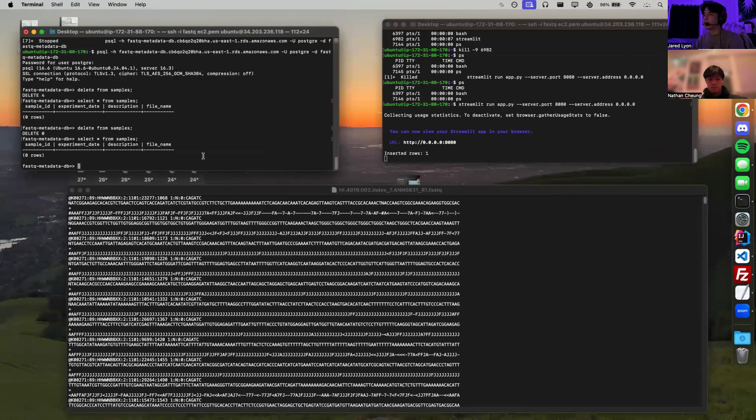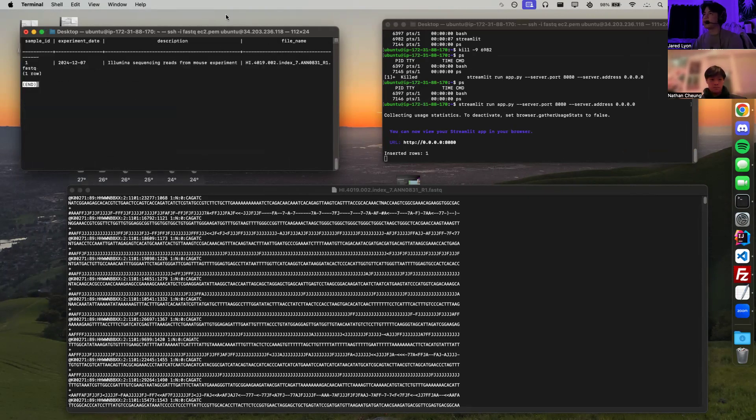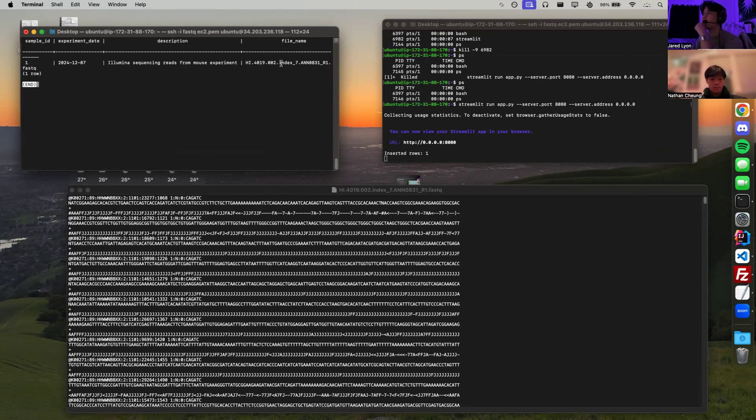Back to the RDS, we can select star from samples. And as you can see, we have our results from that. It's sample ID 1, today's date, our description, and then the file name that we uploaded.